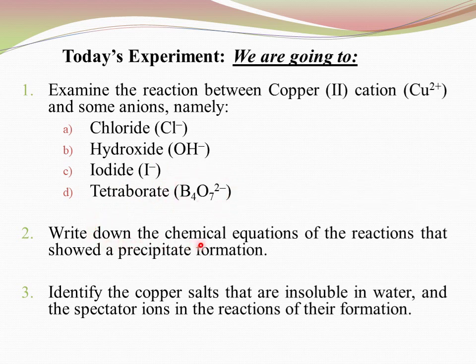Write down the chemical equations of the reactions that showed a precipitate formation. Identify the copper salt that is insoluble in water and the spectator ions.